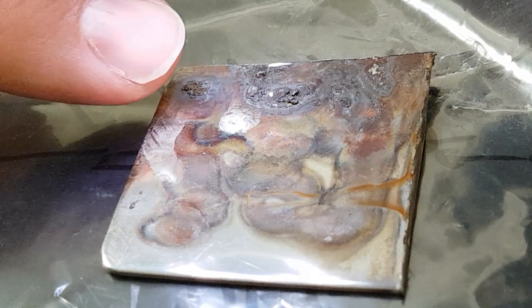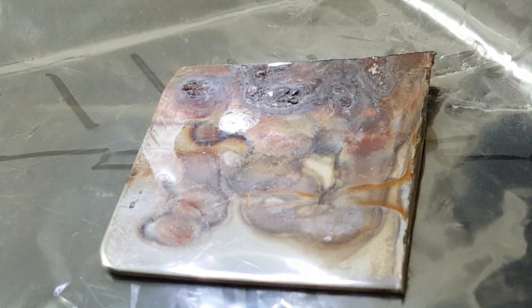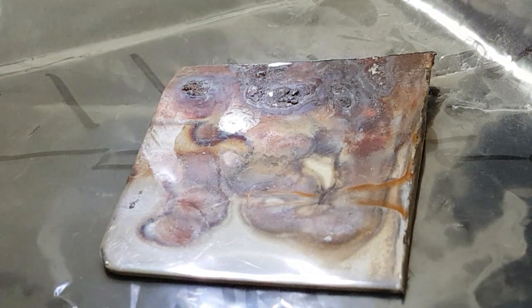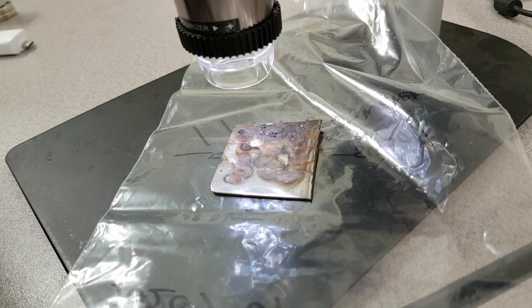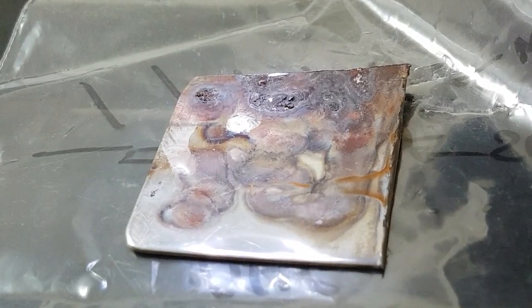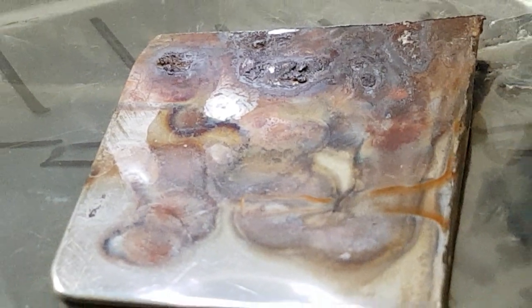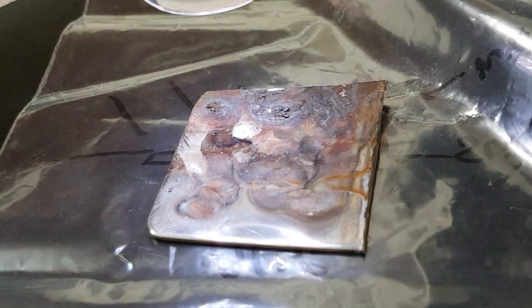It's a pair of two structures — one is the evil twin of the other, next to each other at the same scale. I would imagine this is a loop that is probably coming out of the dark one and going into the light one, or of course it could be vice versa. These are what we're going to look at on the microscope.